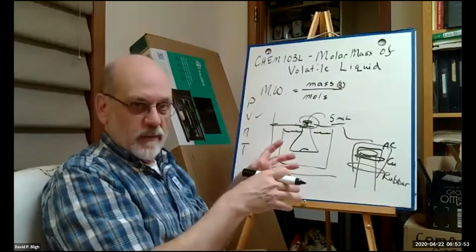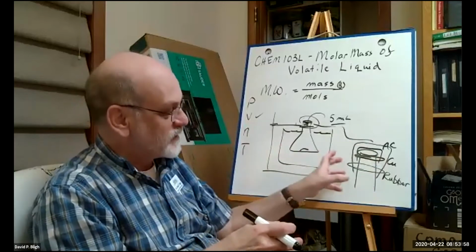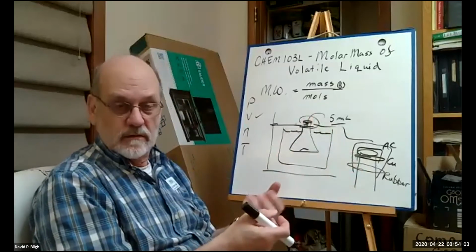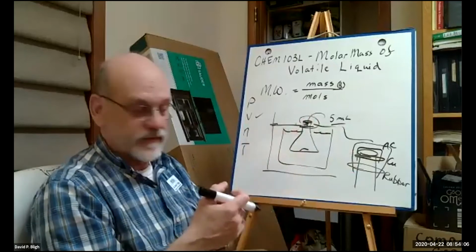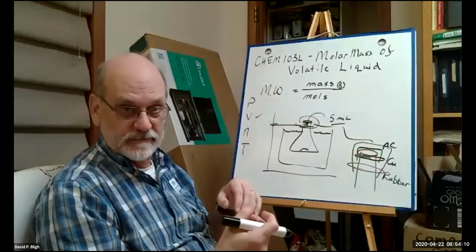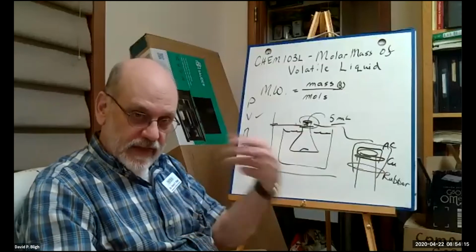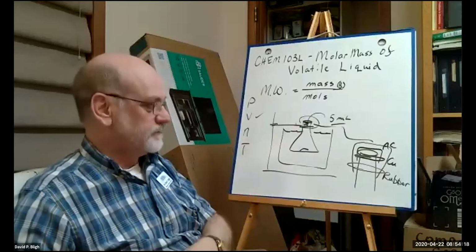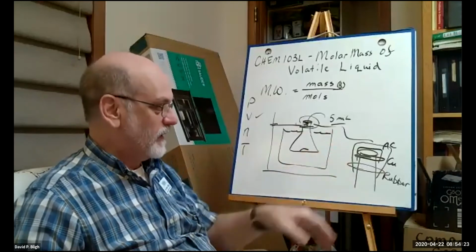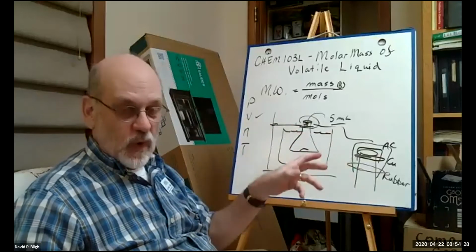Then after the experiment, when you weigh it again, you remove the big foil. And the big foil has protected the inner foil from accumulating condensation or splatter water up underneath, right? So then all you have to do is just dry the outside of the flask. And then you weigh it again with the gas inside. Okay, so that's why you have the extra aluminum foil cap on. But that's not going to be part of your weight. That's always removed before you weigh it each time.